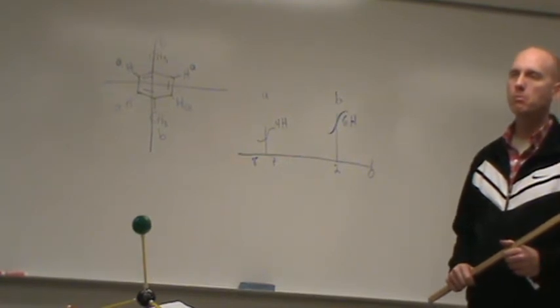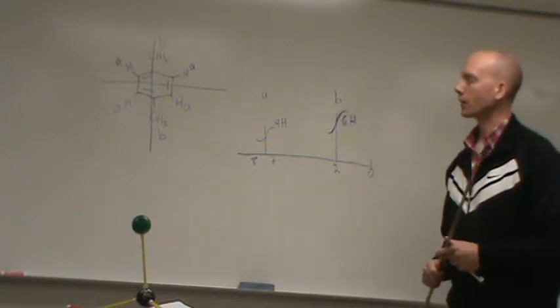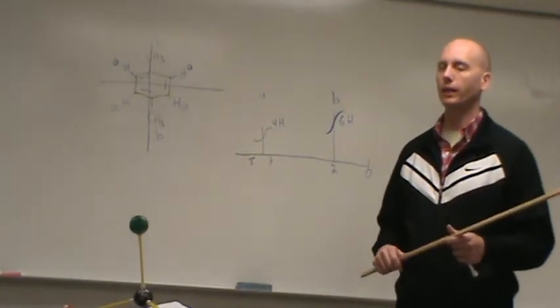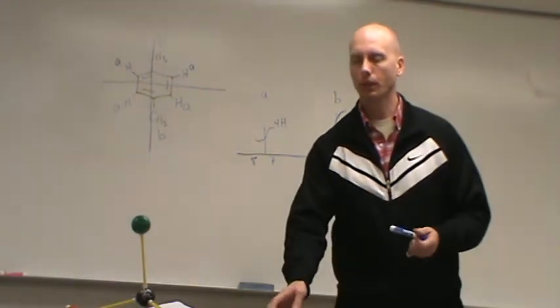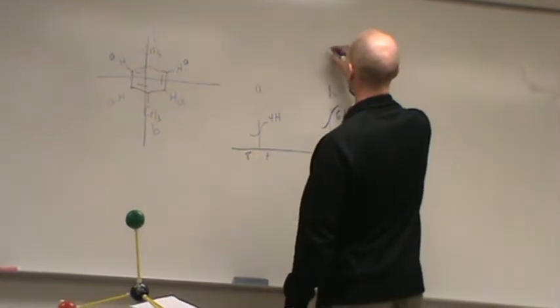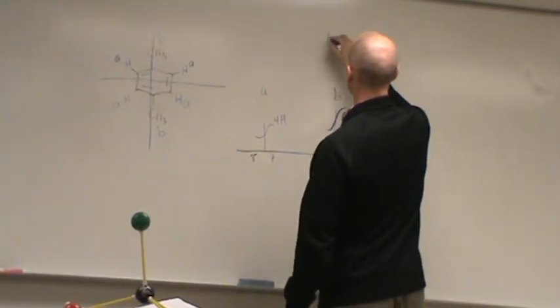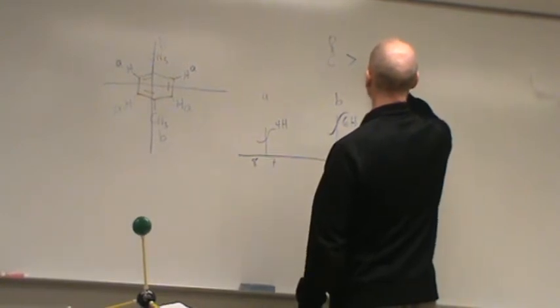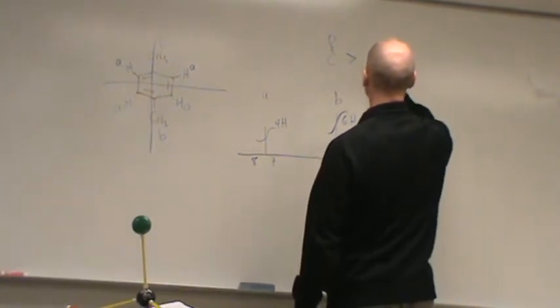So how do I know which one is more? Yeah, usually the carbonyl is a stronger deshielder than the benzene ring. Okay? So if you were going to try to get a gauge of things, carbonyl is usually stronger than a benzene ring.